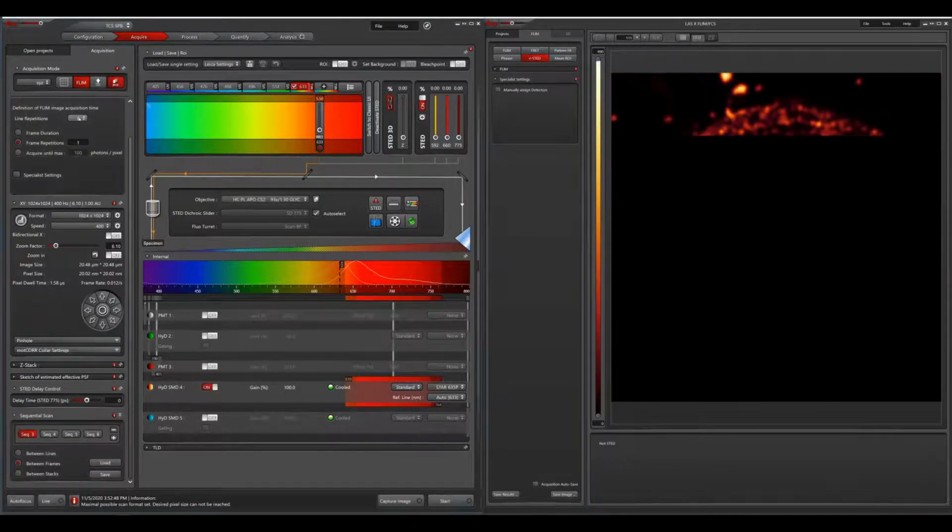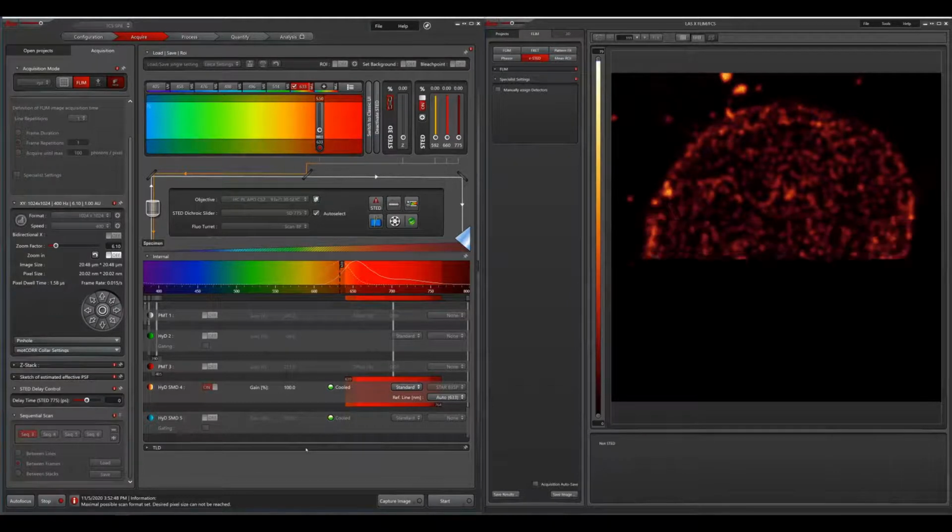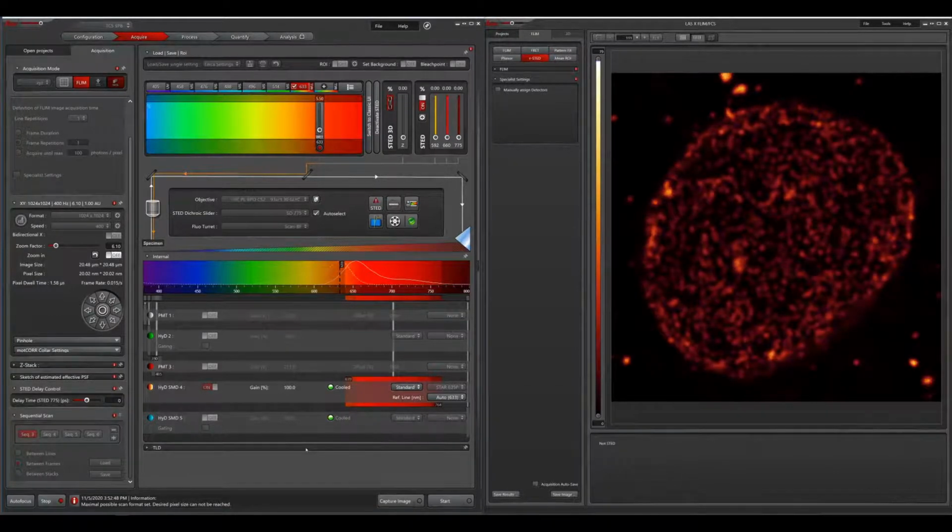And sorry, just quickly do a confocal scan. Yeah, still seems to be good. So actually we can keep continuing with this cell here. And let's put back the settings. Okay. So 2%, 7%, and 20%. And now let's start.